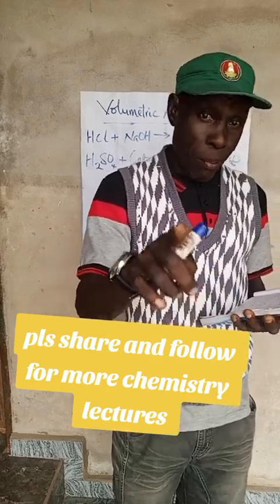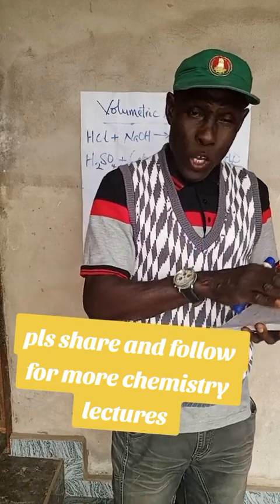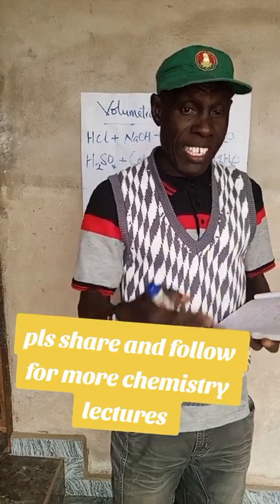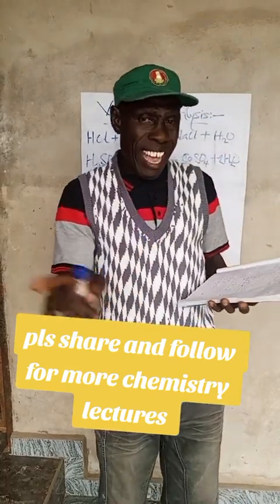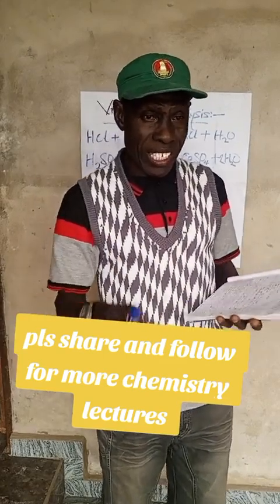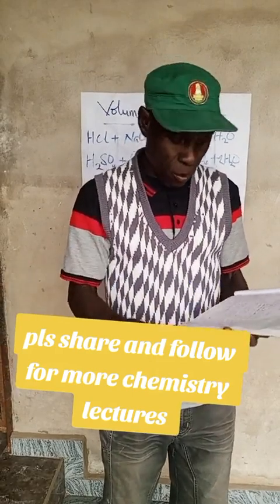That color change will be pink. When the pink color is formed, it means that there is a complete reaction between the acid and the base. In other words, they have neutralized each other. So that pink color is the end point we are talking about. That's what shows you that the acid and the base have completely reacted, and the salt and water are formed.